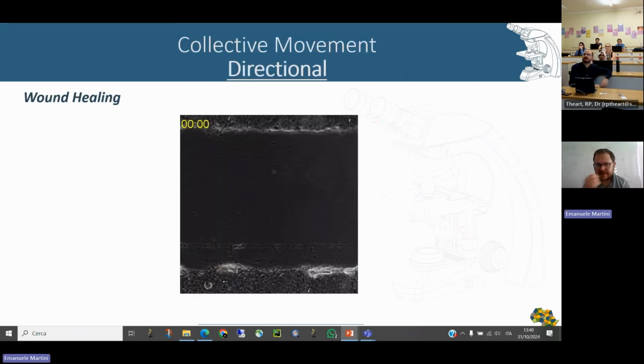Now, in the next hour, I think, 45 minutes, I hope, we will see how to analyze a wound healing experiment.